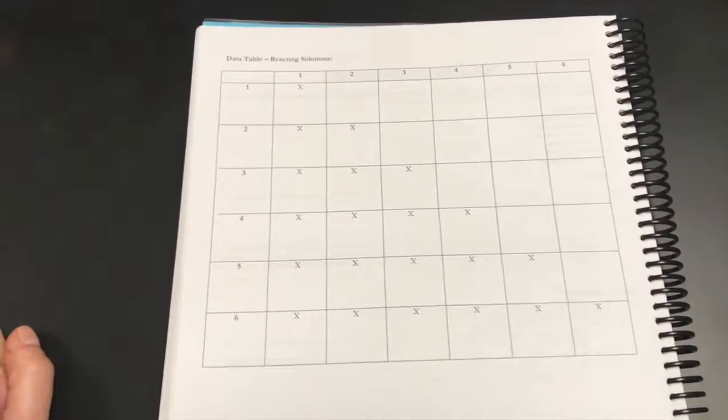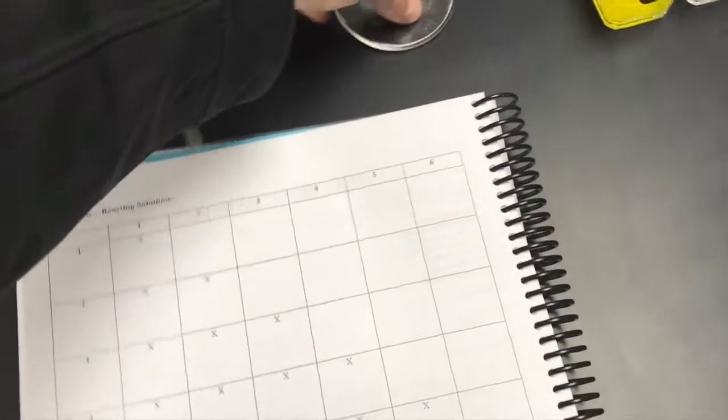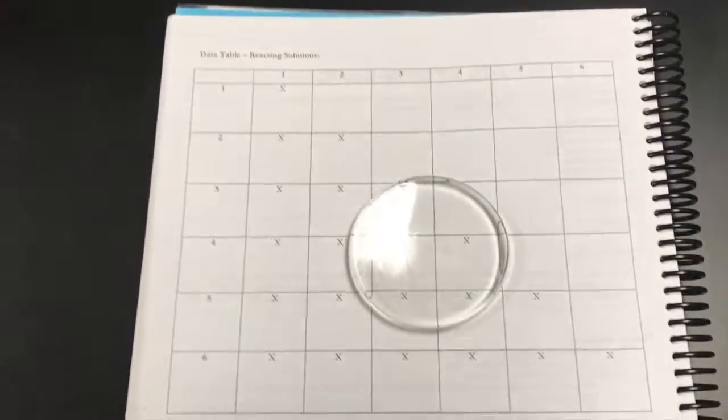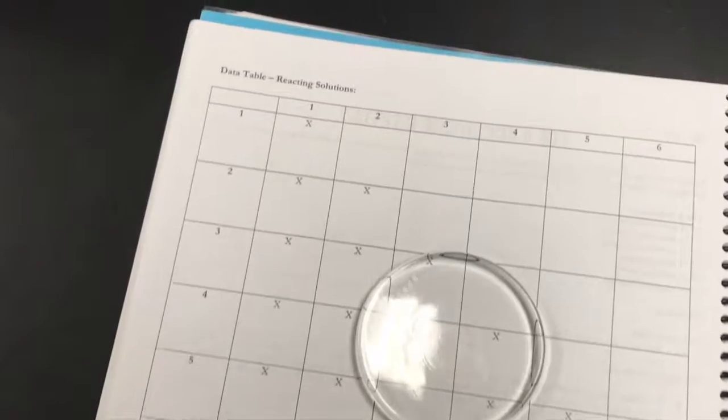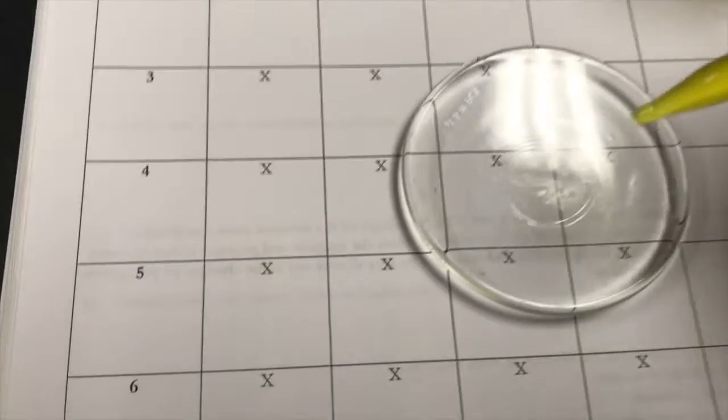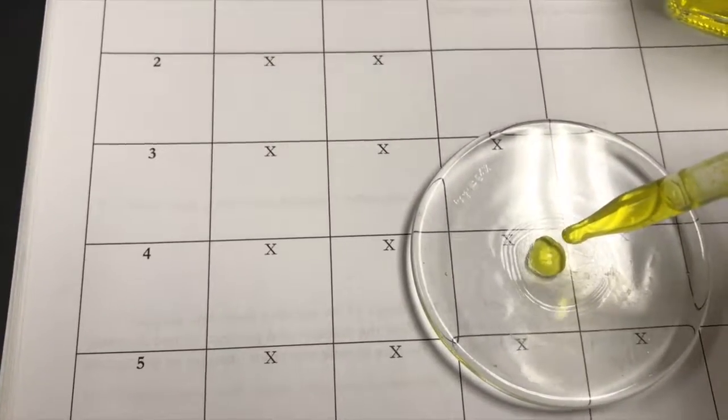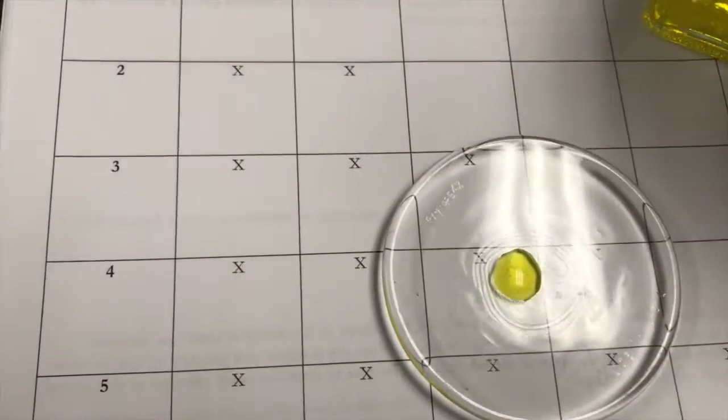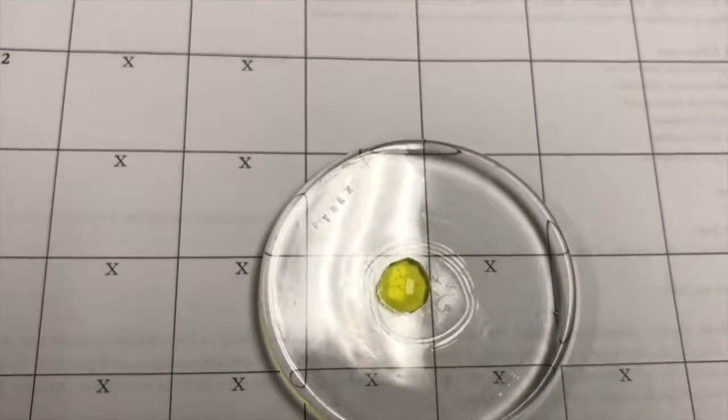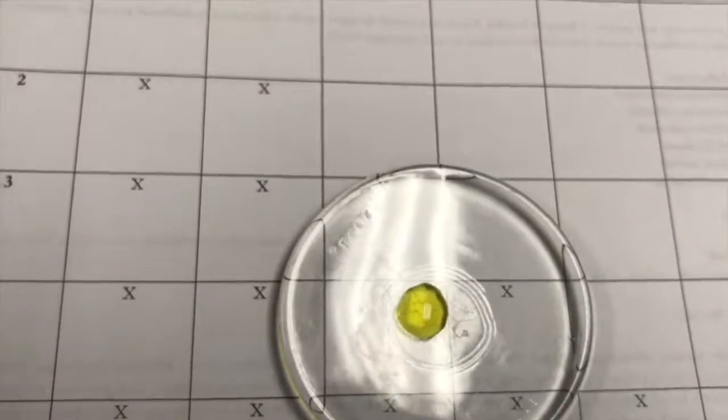For example, I'm going to take my watch glass and I'm going to add two drops of number one, and then I'm going to add two drops of solution number three, and anything that I observe I'm going to record.